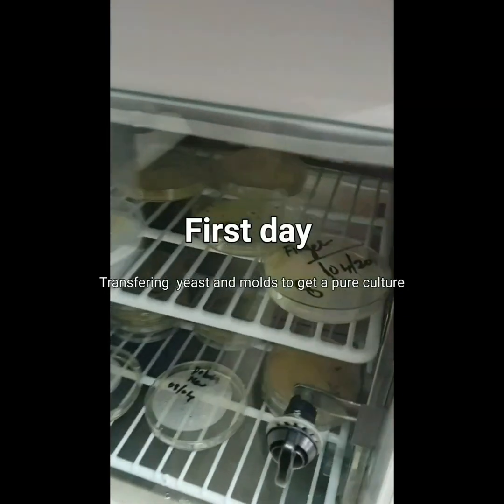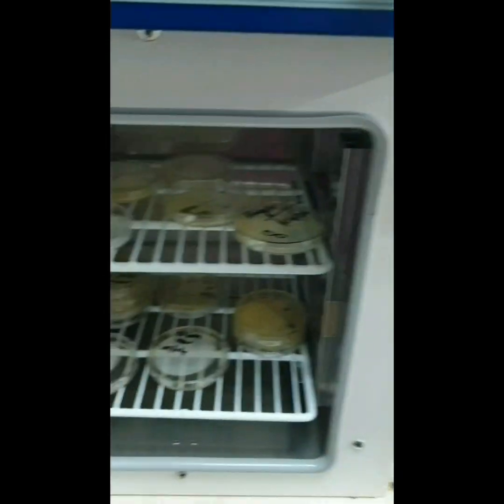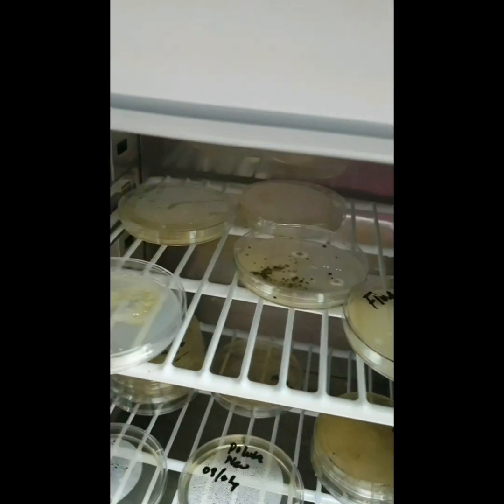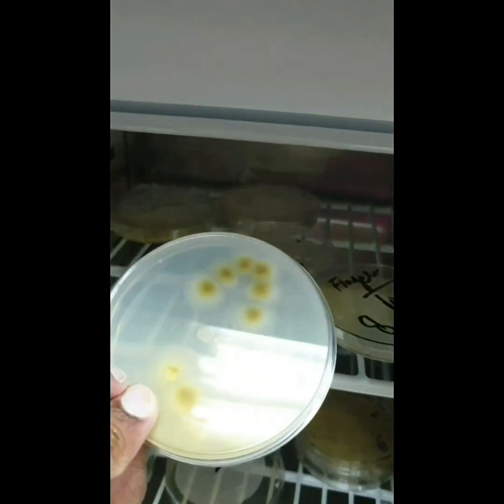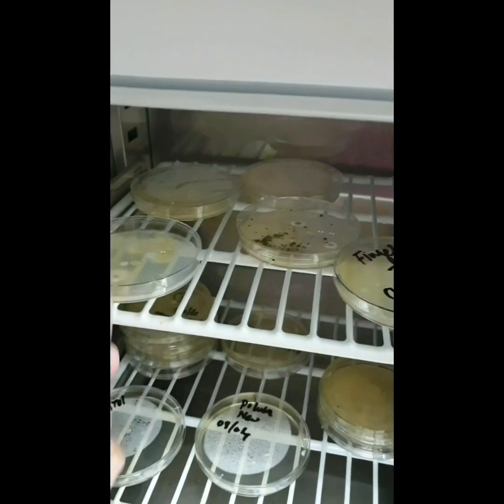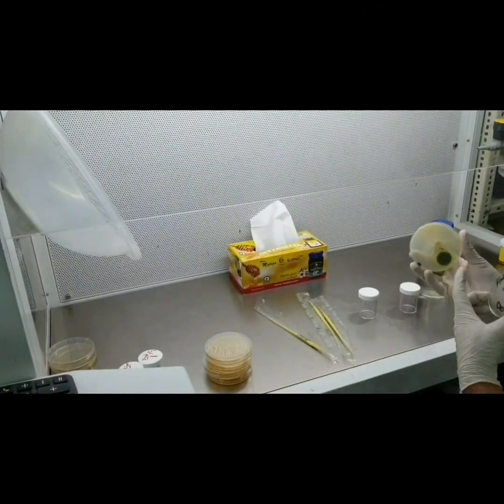We have grown some microbes here in the Muajaza lab. We will now add these microbes into honey, but before that I will culture these microbes and then we will see how effective our honey is against these microbes.